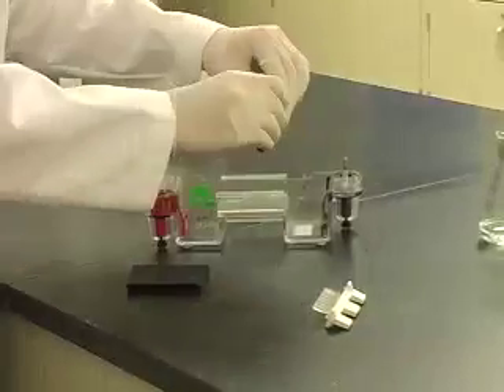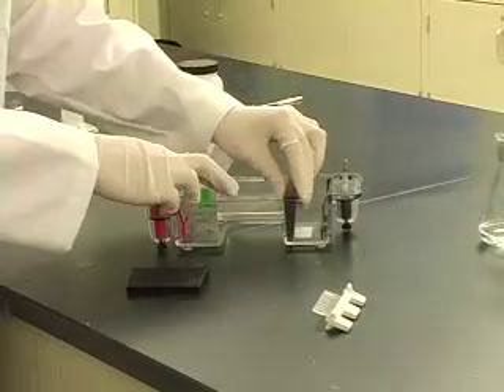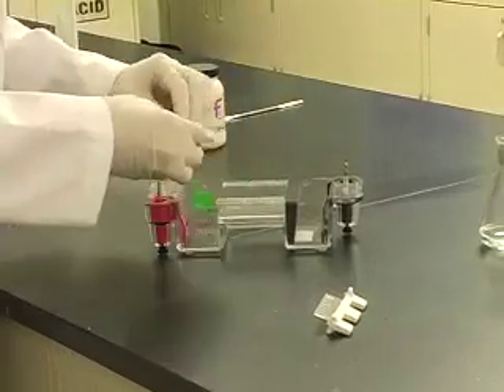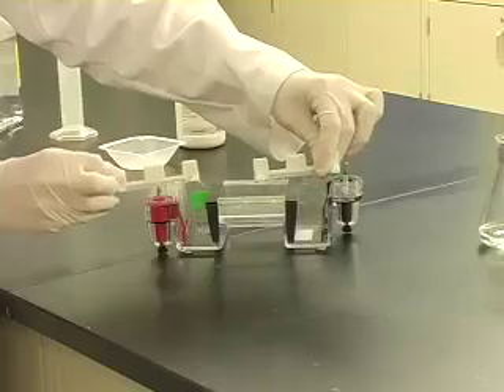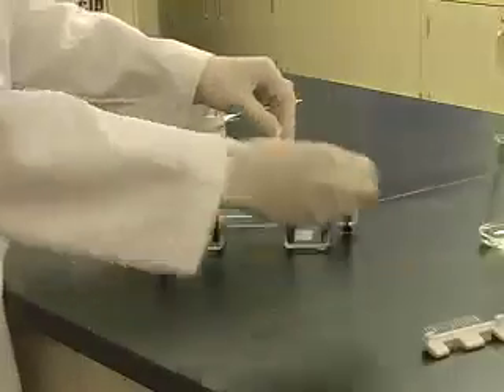While the agarose is cooling, put together the casting apparatus, including the comb, which forms the wells. Different combs create different sized wells. The comb should be closest to the black electrode.